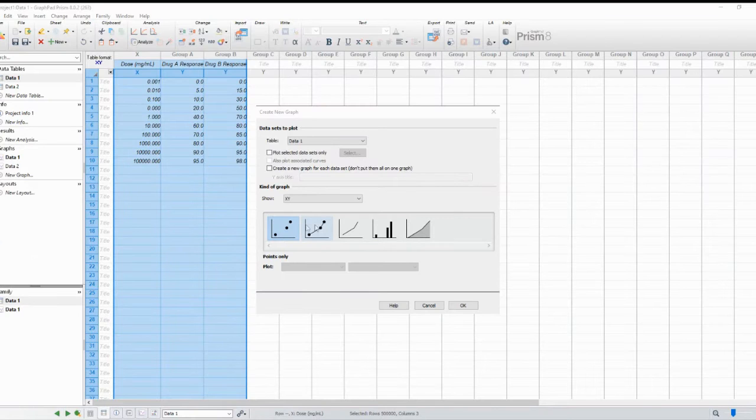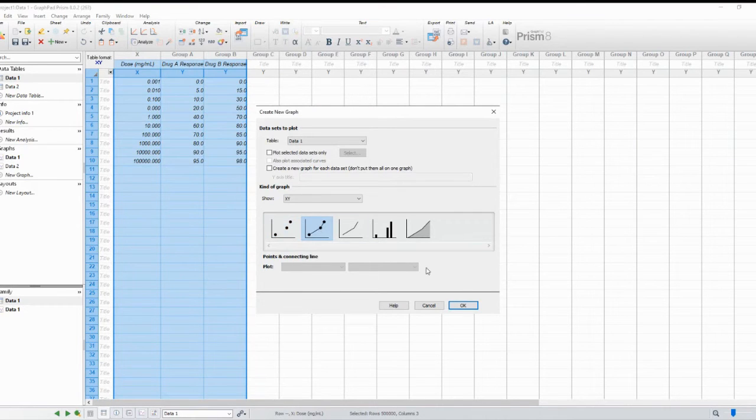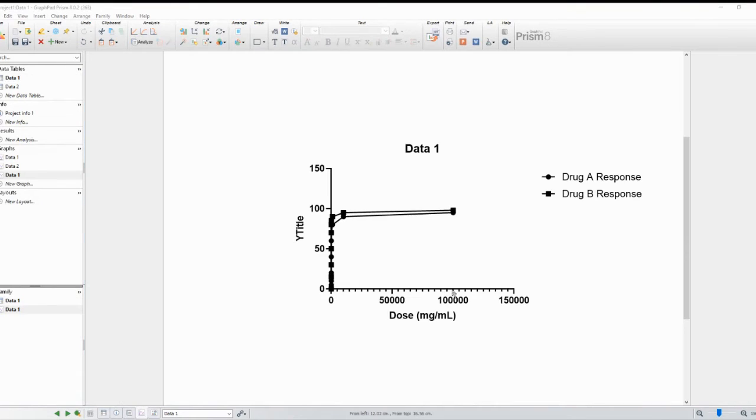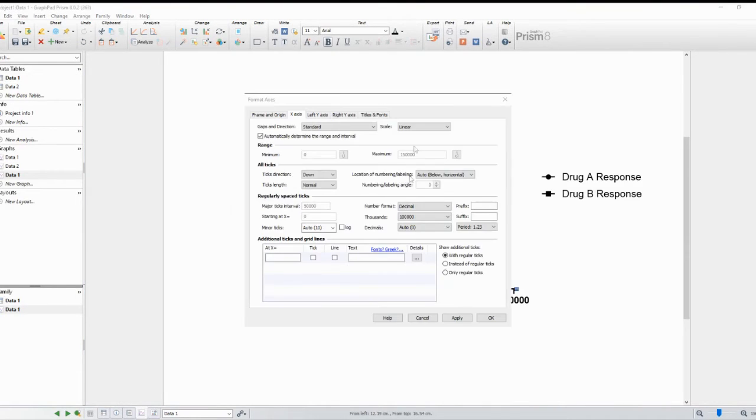In the XY dialog box, you'll see several options for different types of XY graphs. Choose the one that suits your needs. For a dose-response curve, select the one with the connected values.